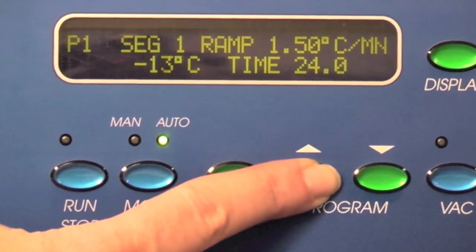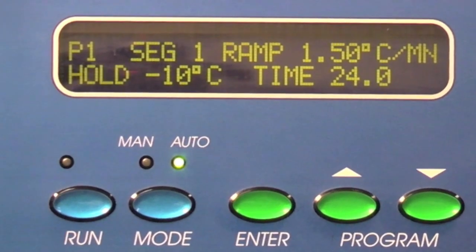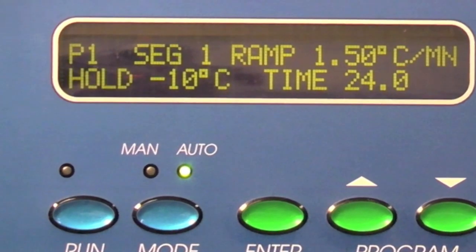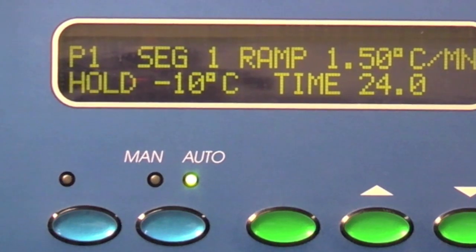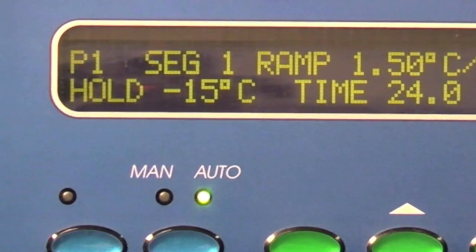If any of the parameters are changed, the enter button must be pressed for the new value to be stored. If enter is not pressed within 10 seconds after the last parameter adjustment, the value will return to the previously stored value.